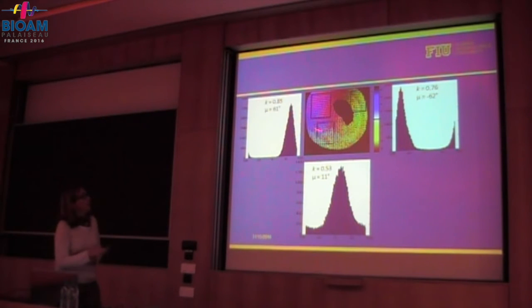So again, we can do the same. Now here my students decided to get really large areas, but even with these larger areas, we can see this distribution, this normal porcine cervix. So these are pretty oriented areas, and we can quantify with kurtosis or with the parameter based on the von Mises distribution.